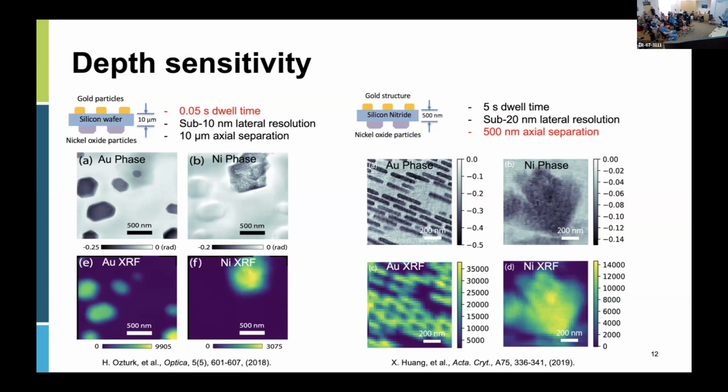Although the image looks pretty good, if we look at the obtained image carefully, we can see there are some, we call them ghost features, representing the shape and the size of the crystal and showing on the wrong plane. This is because those features represent low spatial frequency features, and they don't change much when we propagate within a relatively short distance. So the algorithm couldn't distinguish them and separate them into different planes.